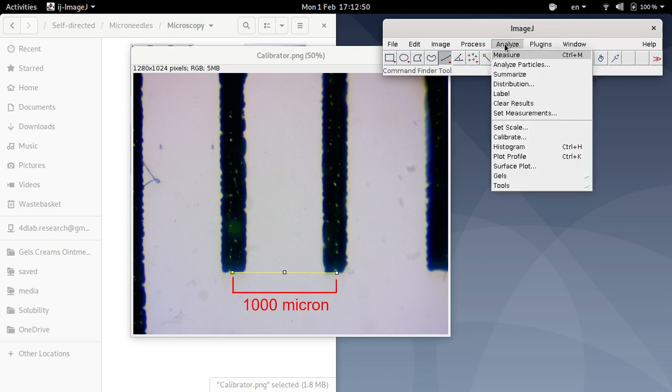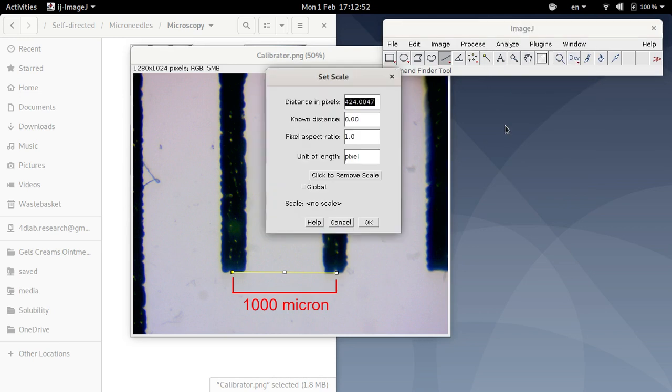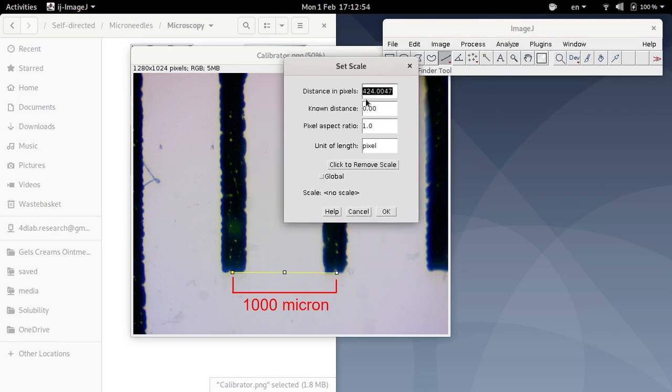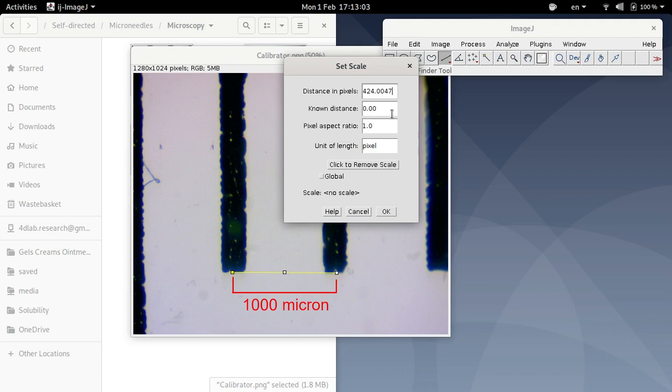So I'm going to tell ImageJ to set that scale. So I go to analyze and set scale. Okay, so ImageJ has determined that that length, that line, is 424 pixels. The known distance is a thousand micron. So I'm going to change that known distance to a thousand.